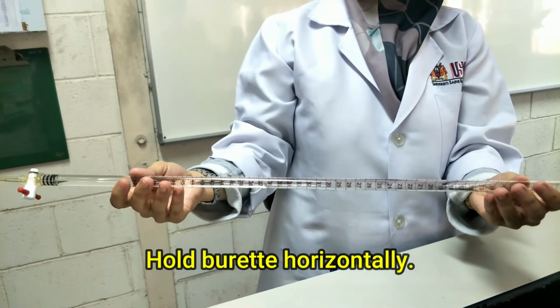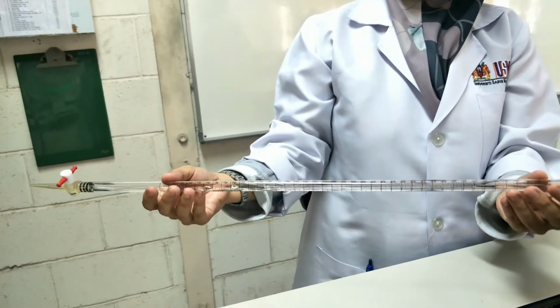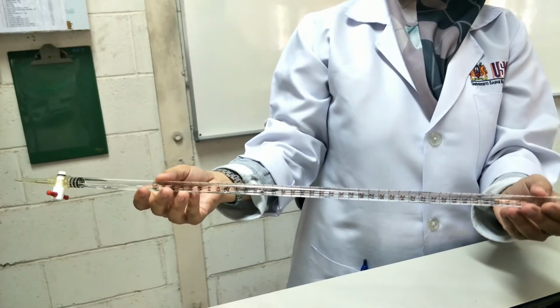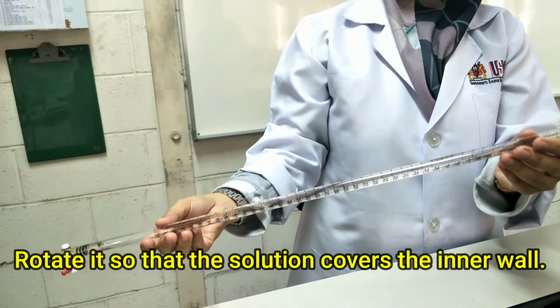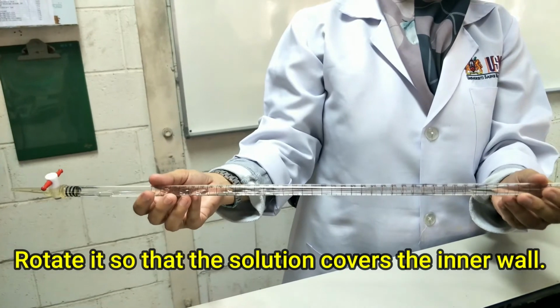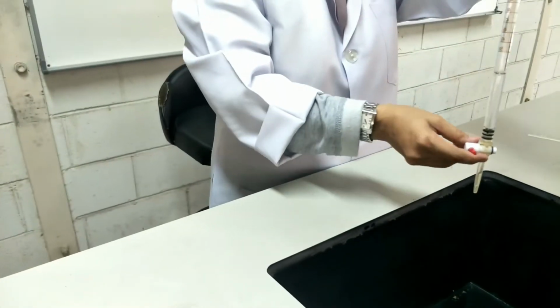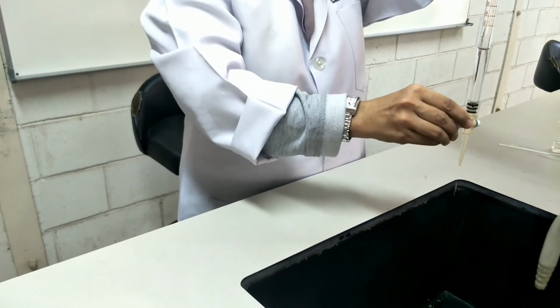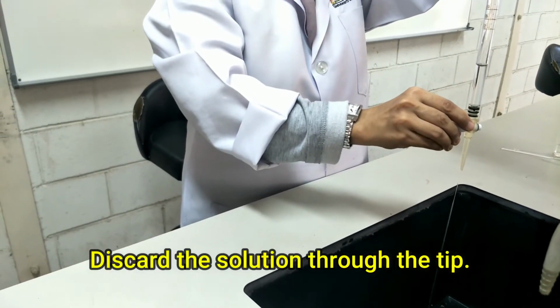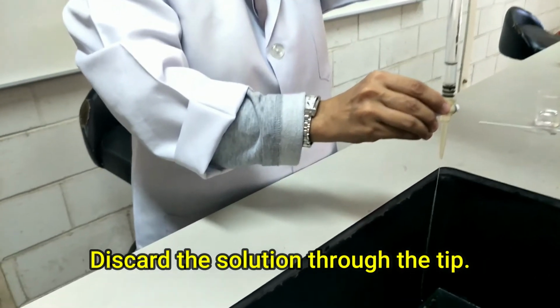Turn the burette into horizontal position. The distilled water should then slowly flow towards the top of the burette. Holding this position, rotate the burette so that the distilled water covers the inner wall of the burette. After that, open the stopcock and discard the distilled water through the tip of the burette.